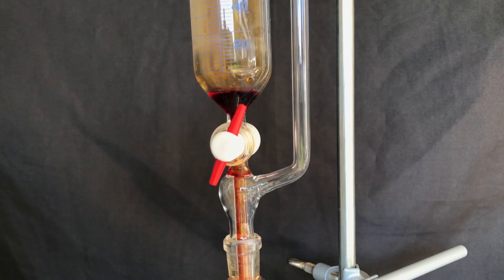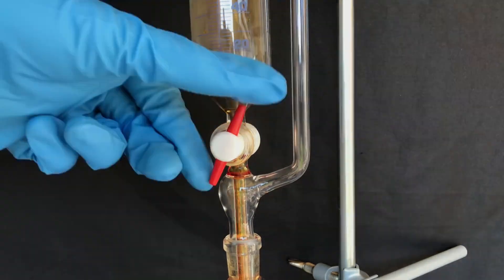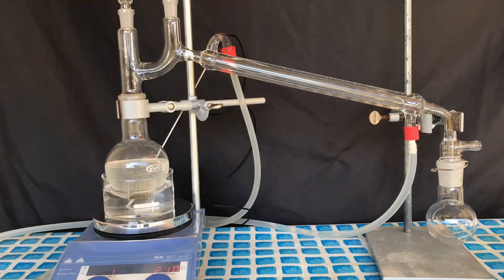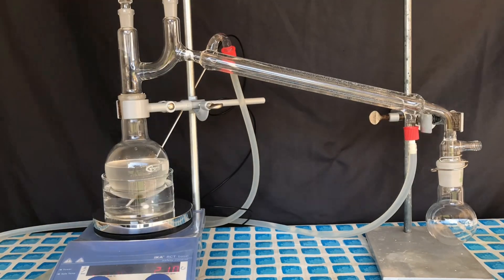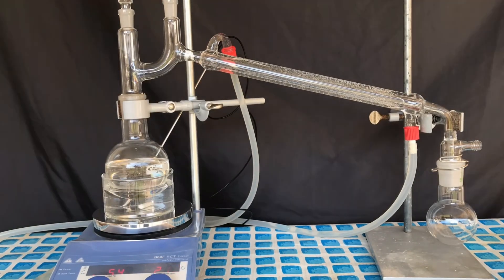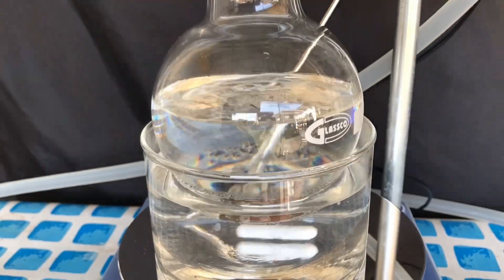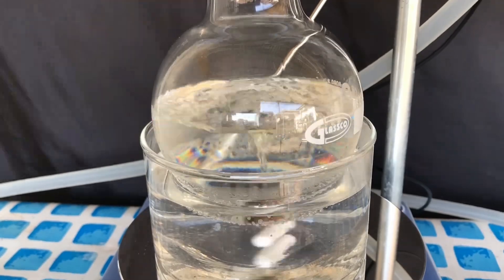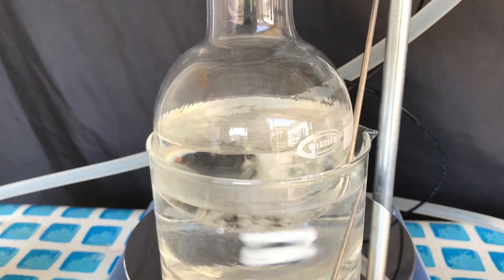At some point all the bromine had been added, we switched off the addition funnel and we set up a simple distillation to recover the dichloromethane. It would also be possible to just boil off the dichloromethane in an open beaker, but I wanted to recover it because you don't have to waste reagents, especially ones that are so easy to recycle.